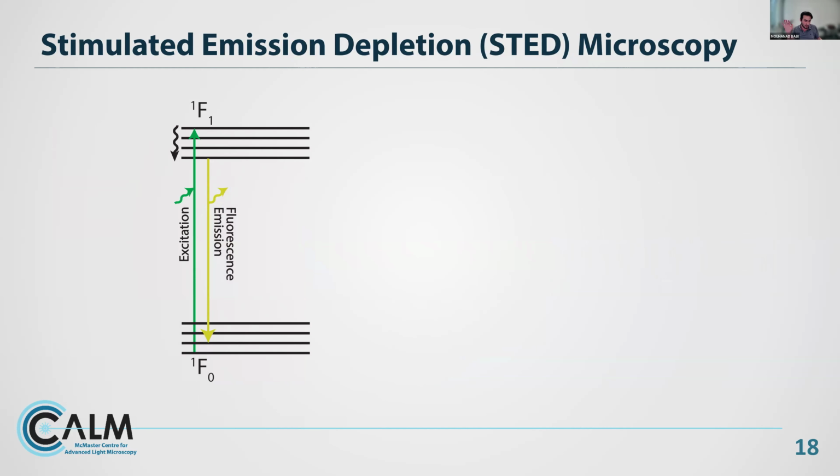So the image scanning microscopy and the structured illumination microscopy techniques are actually quite complex in their operating principles, but in application, they're much easier to execute. Usually, if you can use a confocal microscope or a wide-field microscope, then you can apply these techniques to your samples, with some small caveats on how you're preparing the sample. And they allow you to get almost twice as much resolution as a normal confocal or wide-field microscope. But the 100 nanometer resolution is still not going to be good enough to see very, very small things like transport vesicles or molecular complexes.